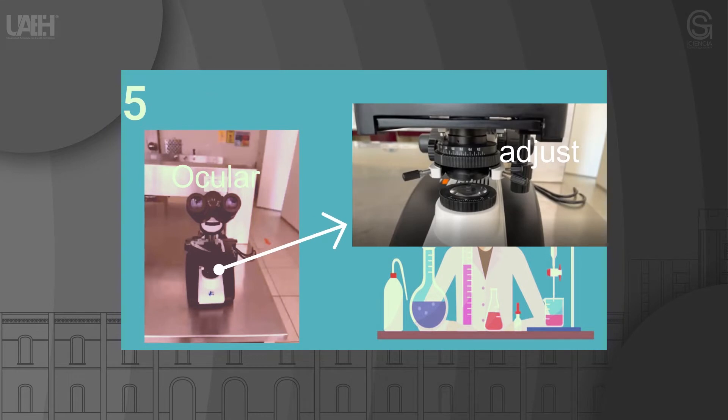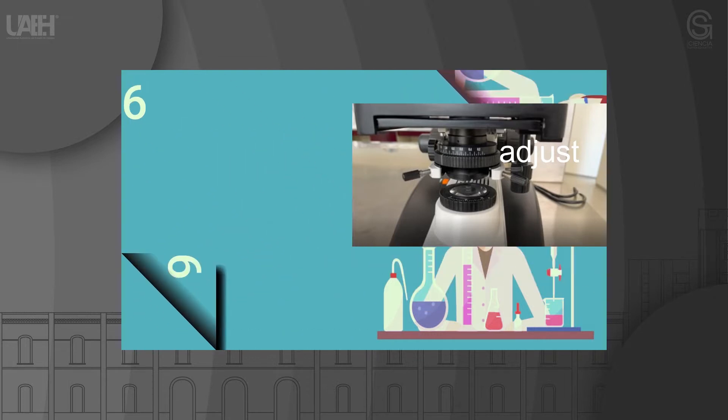Step 5: Looking through the eyepiece, adjust the condenser and the diaphragm to maximize the amount of light reaching the sample. Some microscopes have a small mirror that directs the light onto the sample. If this is the case with your microscope, also adjust the position of the mirror so that the sample is fully illuminated.